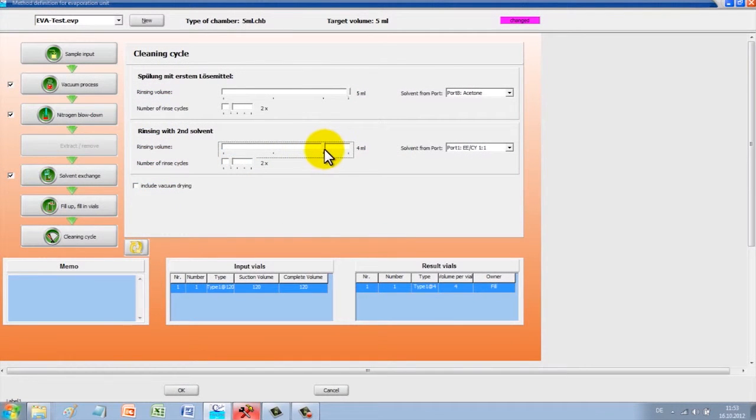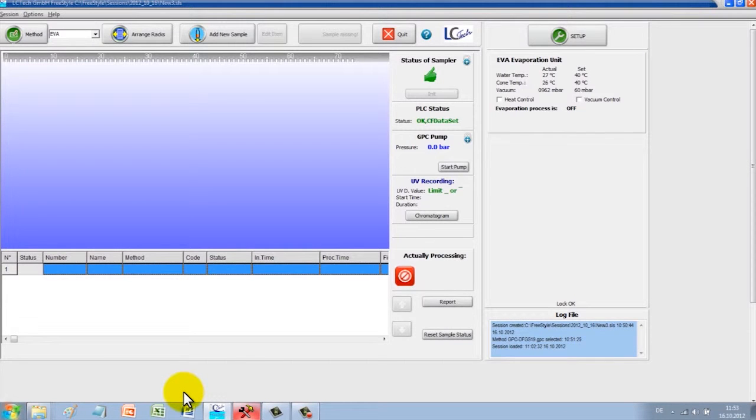Now modify the individual steps. Save and your new method is programmed.